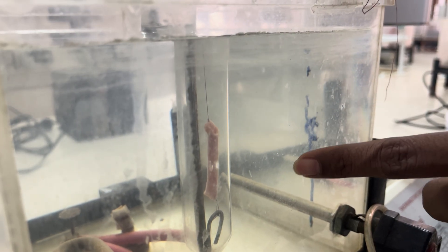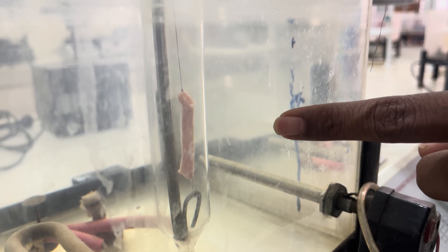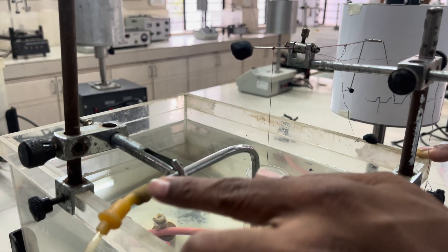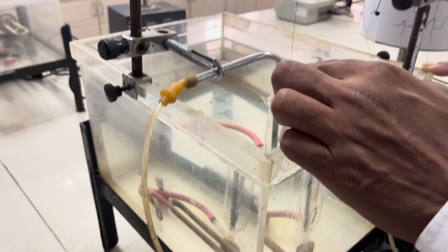One end of the muscle is attached to the muscle holder and the other end is attached to the lever. This is the muscle holder, and the aerator is attached here, which will provide the aeration.